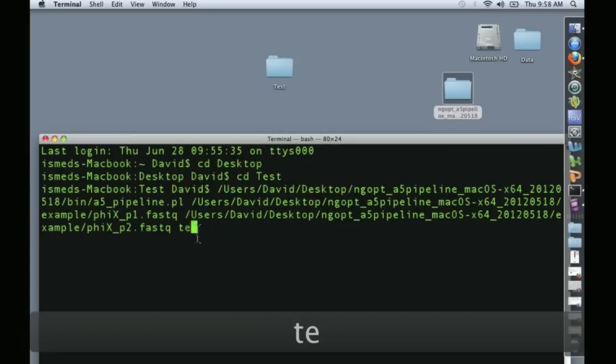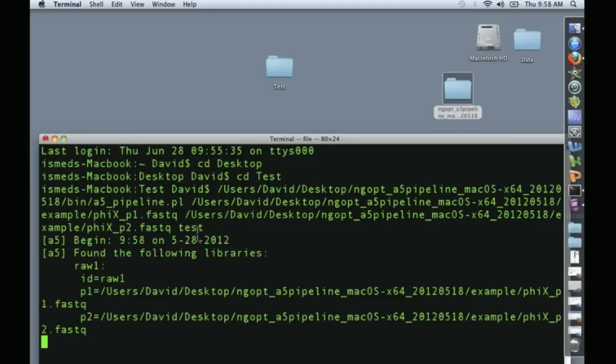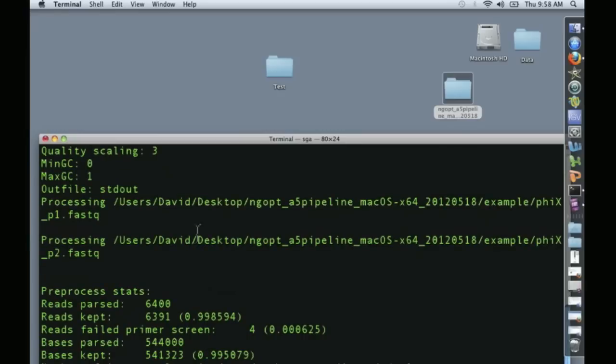So let's just call it test. That's what the output files would be called. Click return and we're running a genome assembly and we'll be back when it's finished.